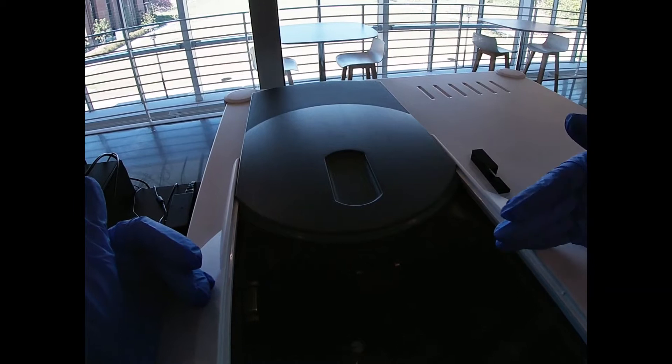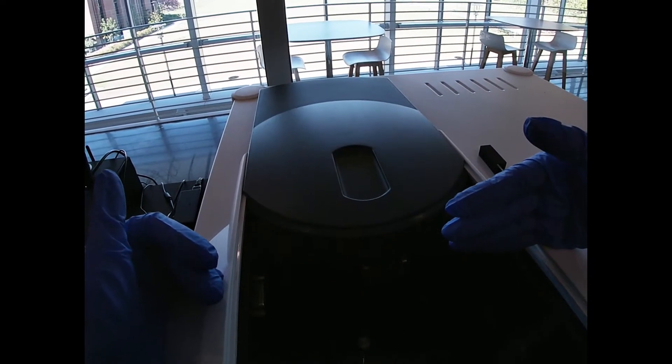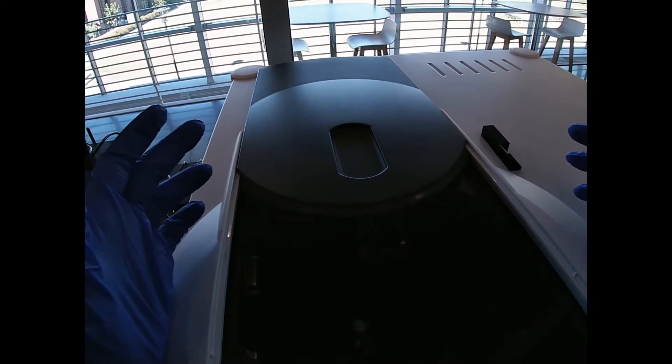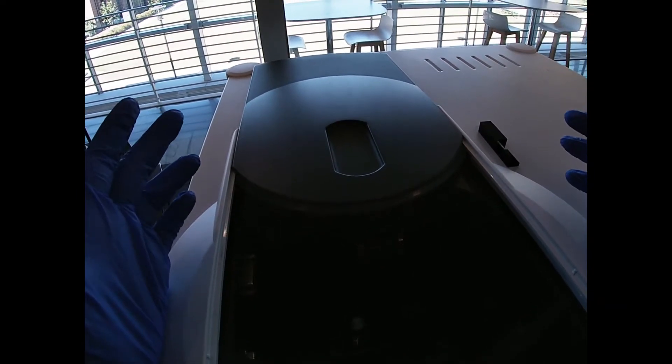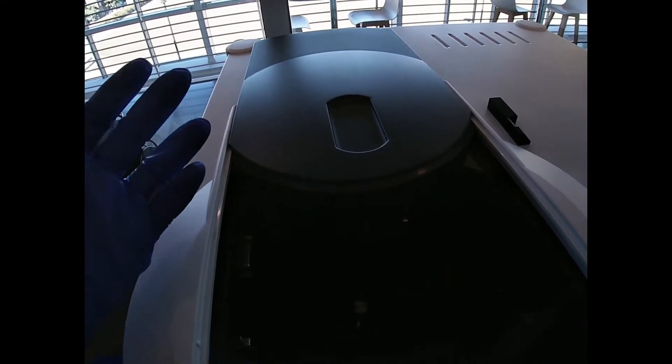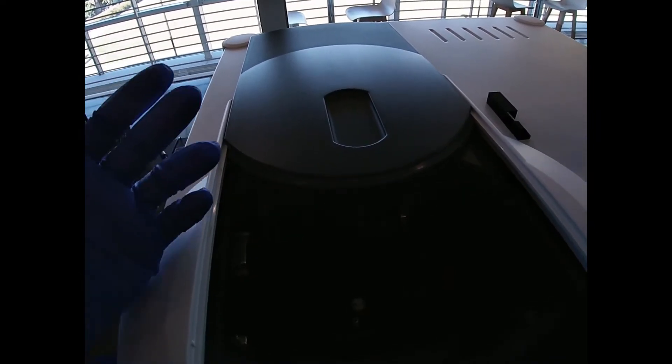Basically what happens is you've got an excitation beam that comes in. It strikes the sample, excites the quinine molecules. When they're excited, they gain energy. When they relax, they release that energy as fluorescence, so they emit light at a different wavelength.